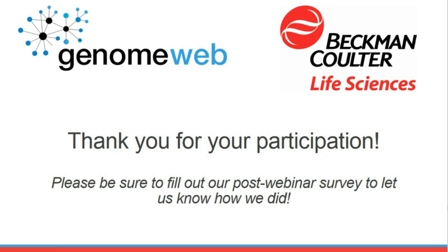And after the addition of the sample and the reaction PCR master mix, does it require mixing before the PCR is actually done? That's a great question. We thought at the beginning that we need to mix it because in larger volumes, we traditionally mix. But because we are reducing the reaction volume, it takes care of mixing by itself.